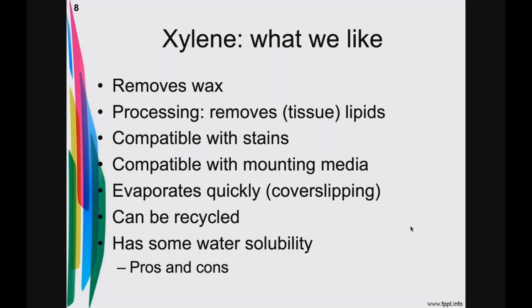We want it to be totally compatible with the stains. After we've made our paraffin sections and you finally apply hematoxylin and eosin, we don't want it to react with the stained slide. We want it to be totally compatible with our mounting media, because whether you're using glass cover slips or a film, you want that mounting media, that film, to be compatible with the xylene. We want it to evaporate quickly. Some of you may have had experience with xylene substitutes that are oily, and they make for a great problem with cover slipping.